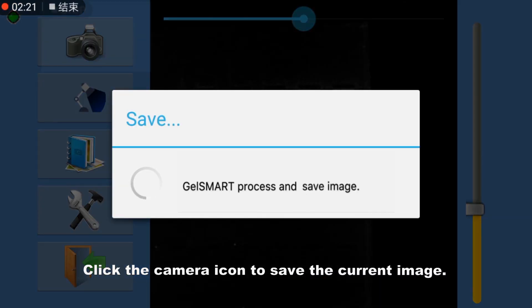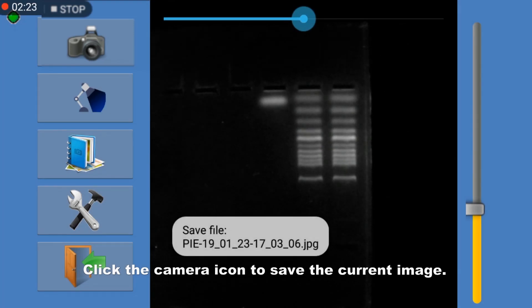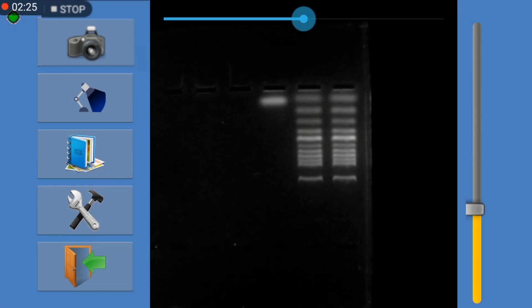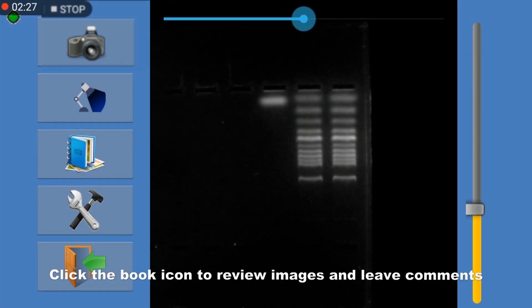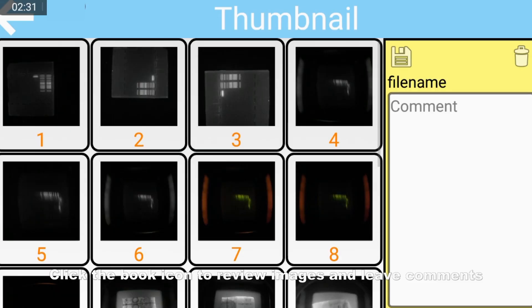Click the camera icon to save the current image. Click the book icon to review images and leave comments.